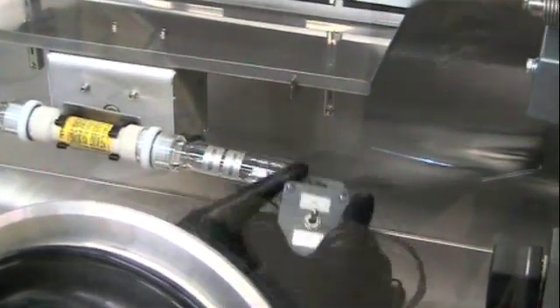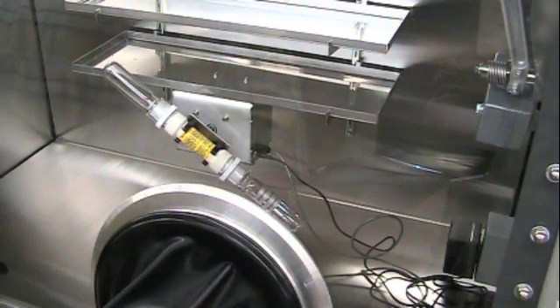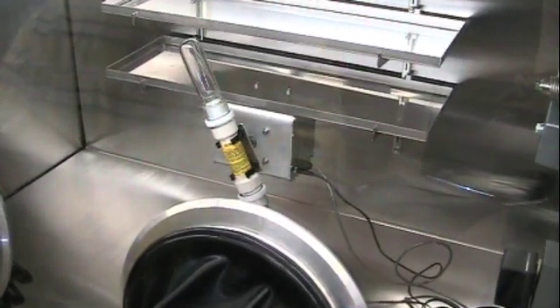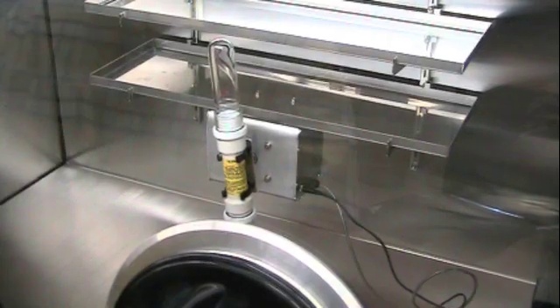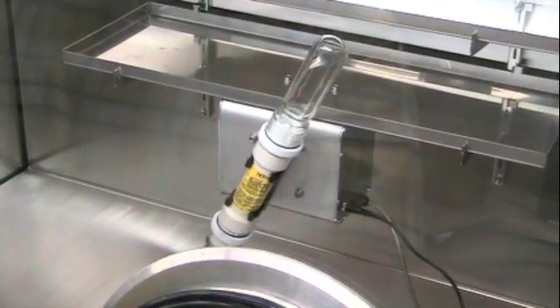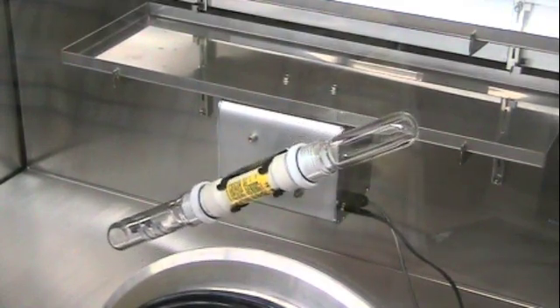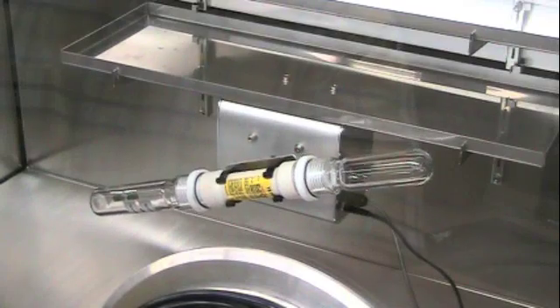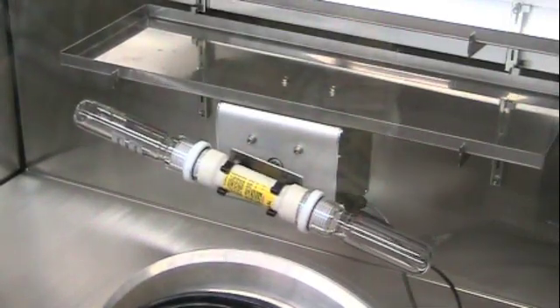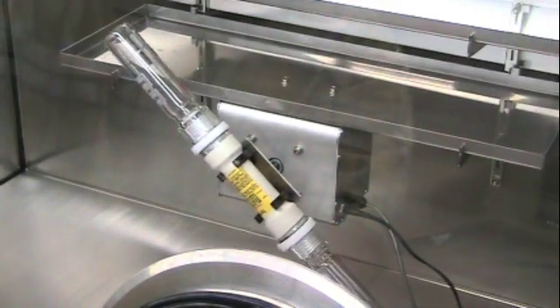Turn the run/jog switch to run. And that is how you install the Inbox Solvent Dryer.